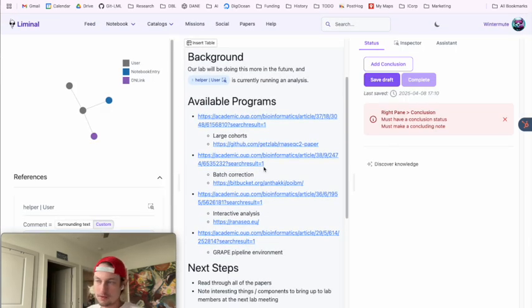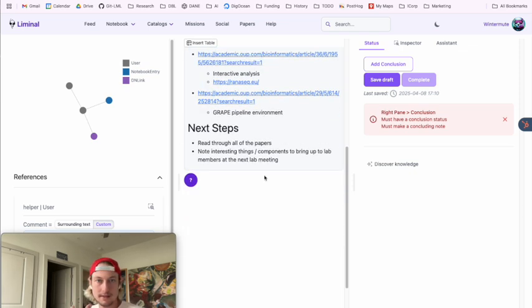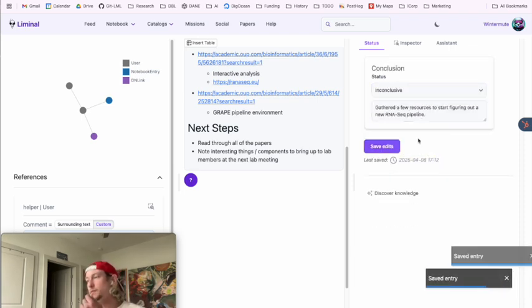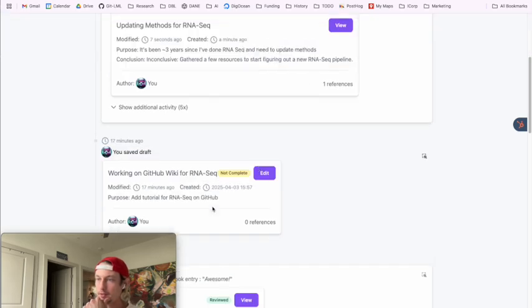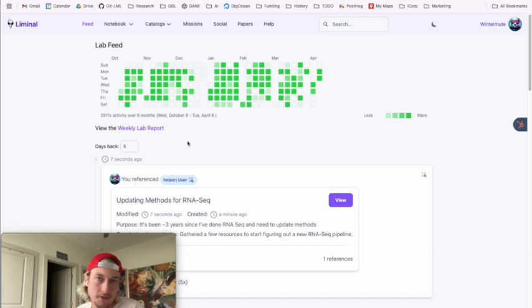I like to work in very granular notebook entries. I like to open something and then close it. And so what I'm going to do is add a conclusion. Awesome. And I'm just going to complete this. This is now complete, right? I did barely, took me hardly any time. It actually was good for me to slow down and write my thoughts.